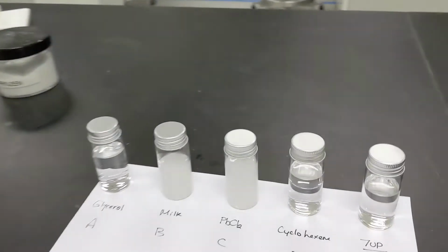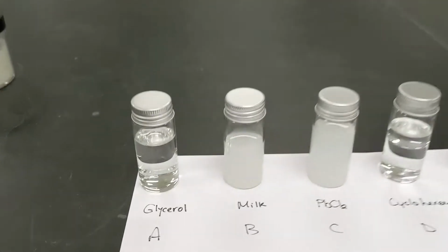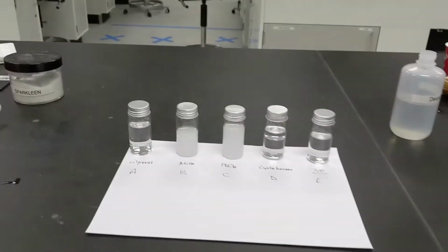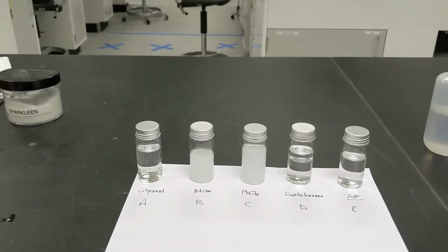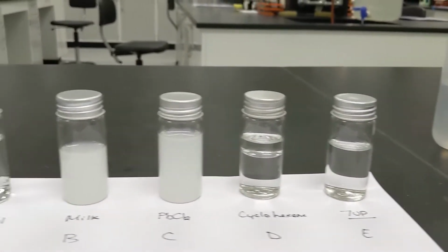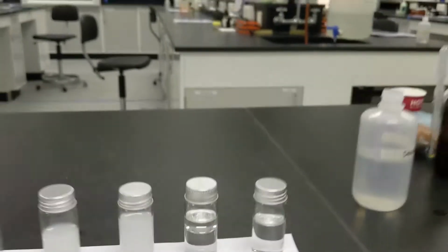So I'm going to dim the lights, and we're going to shine a laser through these and see what happens. Okay, and I might just add a little more water to the milk so they're all around the same level. So I'll be right back with the lights darkened, and before I shine the laser through these, I'm going to give them a shake to make sure everything is as mixed as possible.